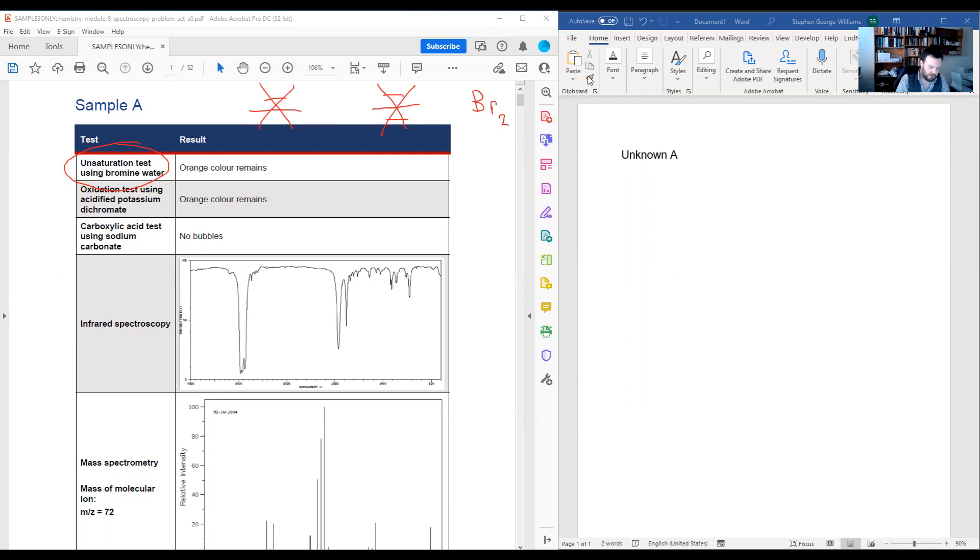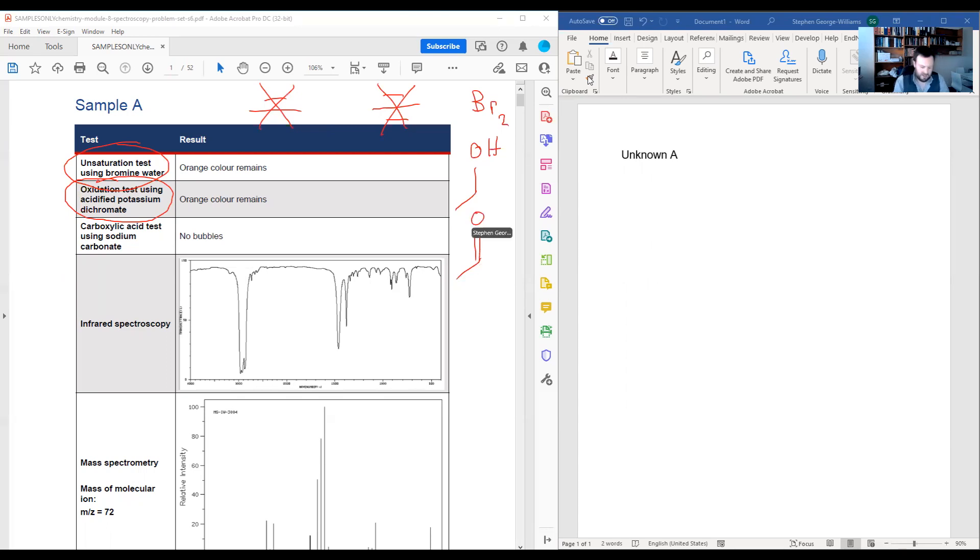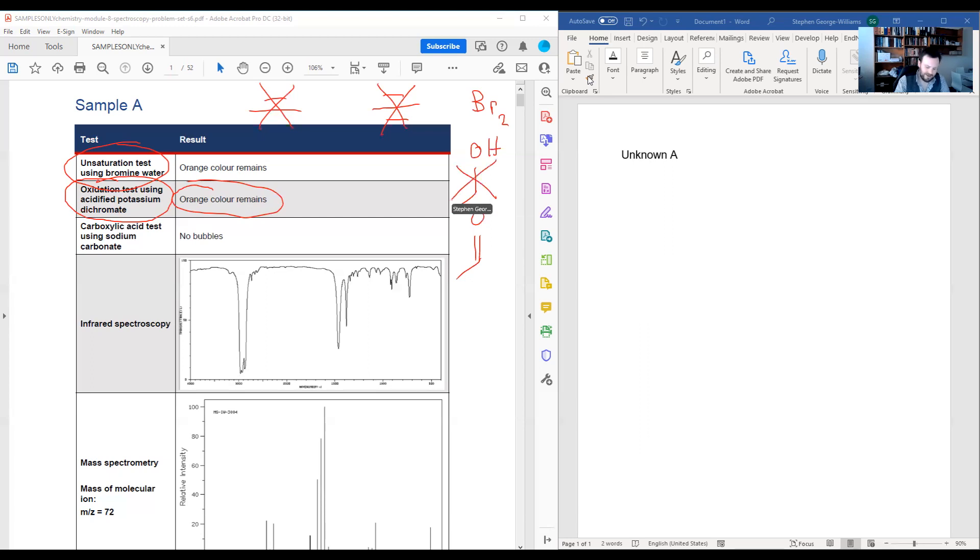Moving on to my next test, which is my oxidation using acidified potassium dichromate. It's an oxidative test, so it's looking for things that can be oxidized, like alcohols, aldehydes, or similar. In this particular case, we're seeing this orange color is remaining. Potassium dichromate is an orange solution, so if it remains, it means it did not oxidize any species. So we're saying there's no alcohol, and it's unlikely there's any aldehyde in here either.